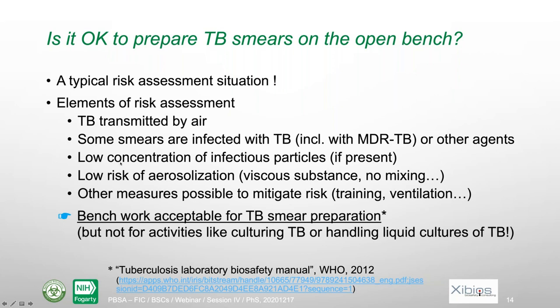But if there is some TB or some other infectious agent in smears, normally it will be in low concentration, so nothing to do with a culture, for instance. Also, when preparing a smear, the risk of creating an aerosol is very low. It's quite viscous, so it's not prone to make an aerosol very easily. And there is no activity such as mixing. We just have to put some of the smear on a plate, and that activity is not really something that will generate aerosol.